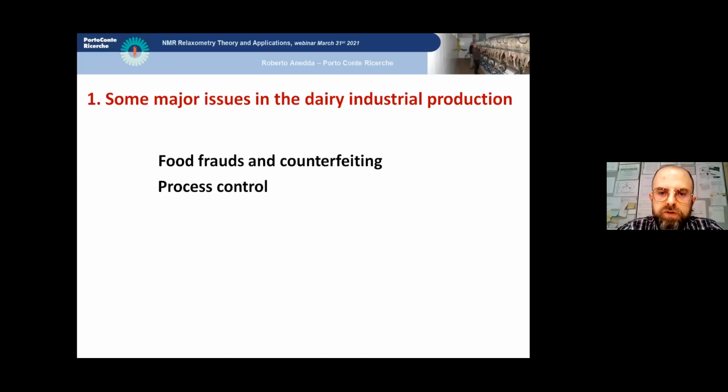And sometimes they need to standardize as much as possible the quality of the products. Therefore, they need to check the quality features of their products and communicate them to the stakeholders and finally, of course, to the consumers by means of rigorous quality control and quality assurance and assessment processes and protocols.